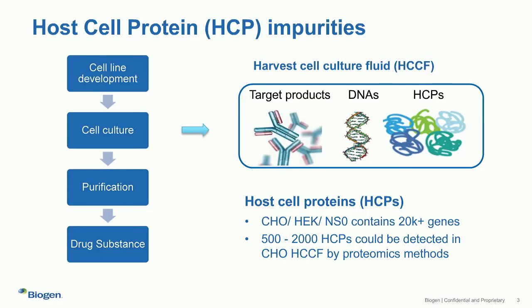A typical biopharmaceutical process is composed of 4 different steps described on this slide. First, an expression cell line is chosen for the production of the biologics. The second step is the cell culture step, which is commonly known as the upstream process, followed by a downstream process to purify the product, and at the end formulating into an API, also called the drug substance step. Each one of the steps contributes to the control of process-related impurities, such as host cell proteins.